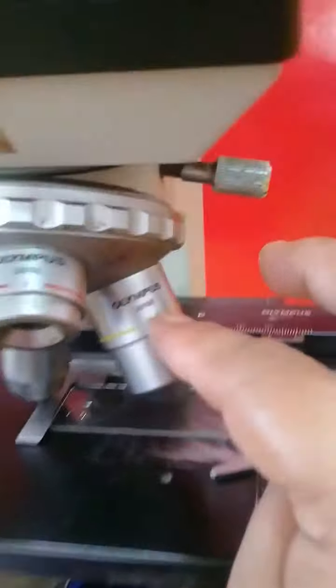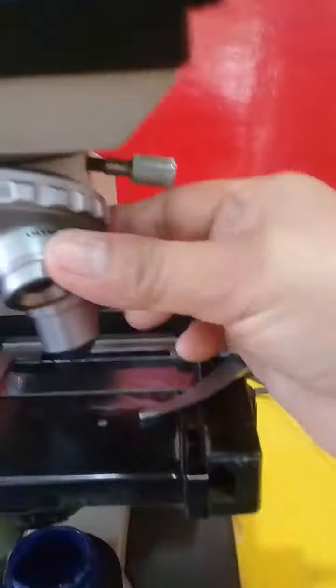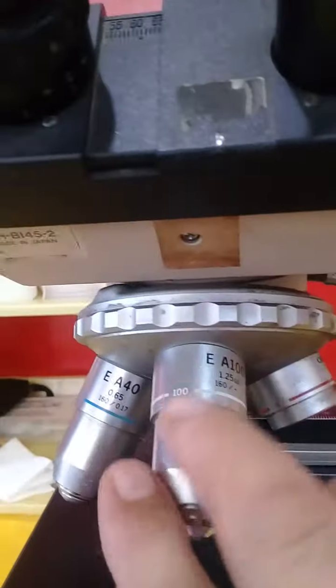This color — the yellow one — is the low power. And if you want to view it well, you can use this one; this is the high power. And these are the revolving nosepiece.